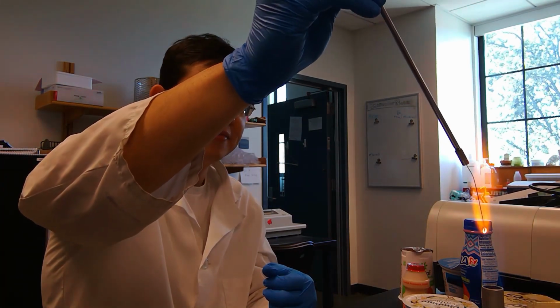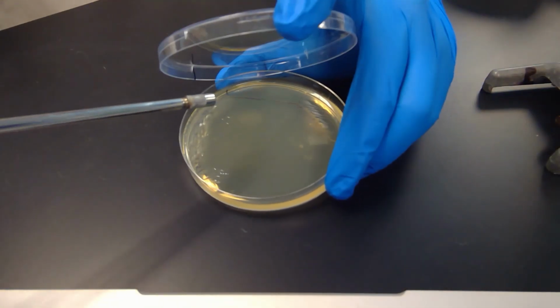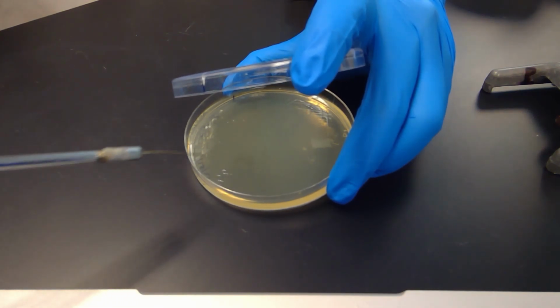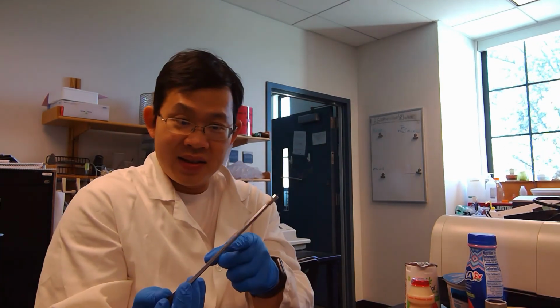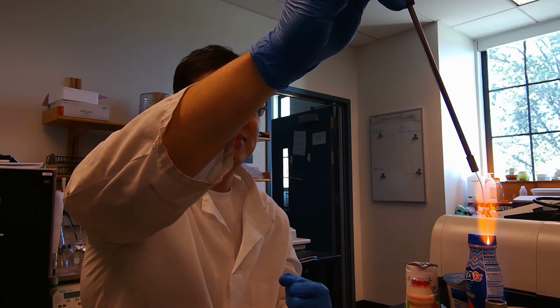Alright, we're done with quadrant 3. Now let's make our last quadrant. Okay, as usual, sterilize it. It's done. So let's make the last one. Here we go. Alright, we are done. So now before you put your tool away, you want to sterilize it one last time. Here we go. Alright, that is basically the streak isolation technique.